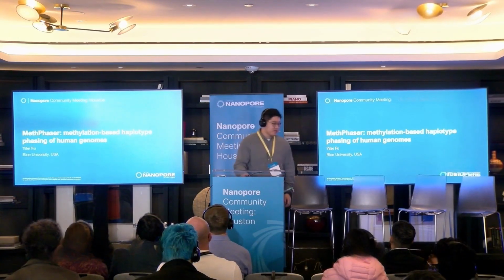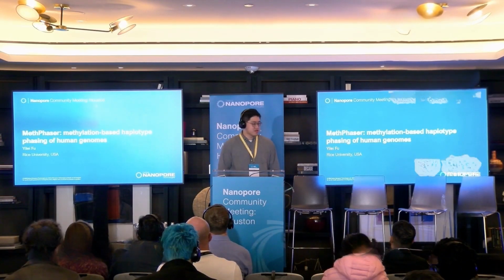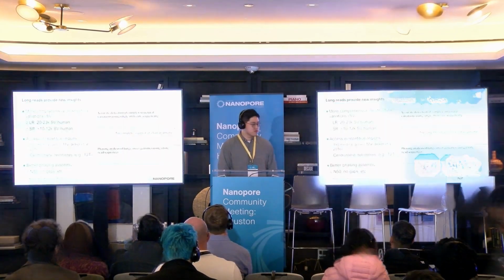Hello, everyone. Today I'm going to talk about my work, MethPhaser, methylation-based haplotype phasing of human genomes.